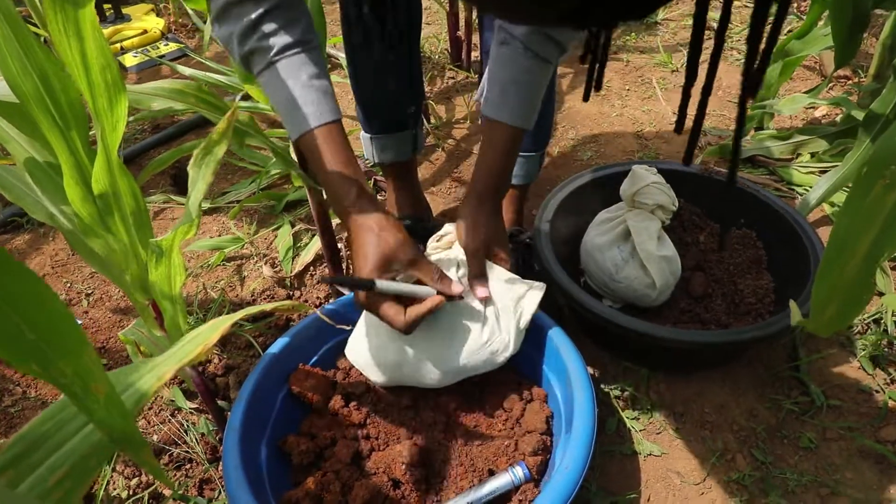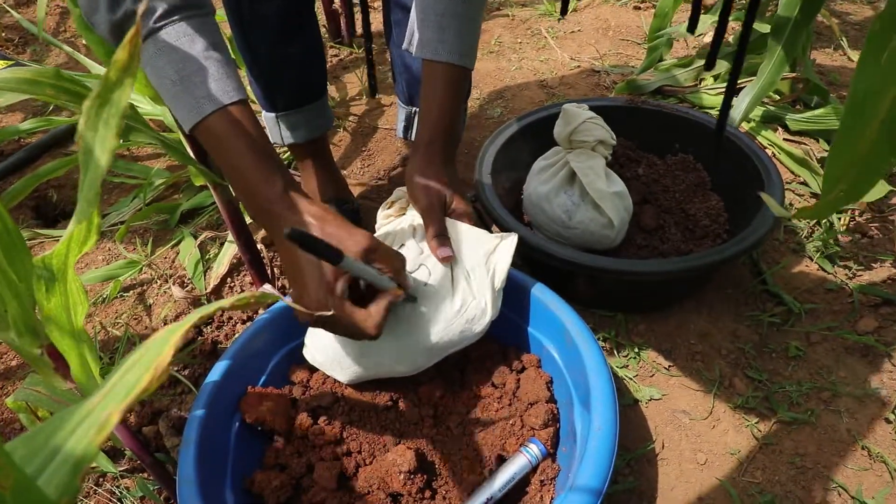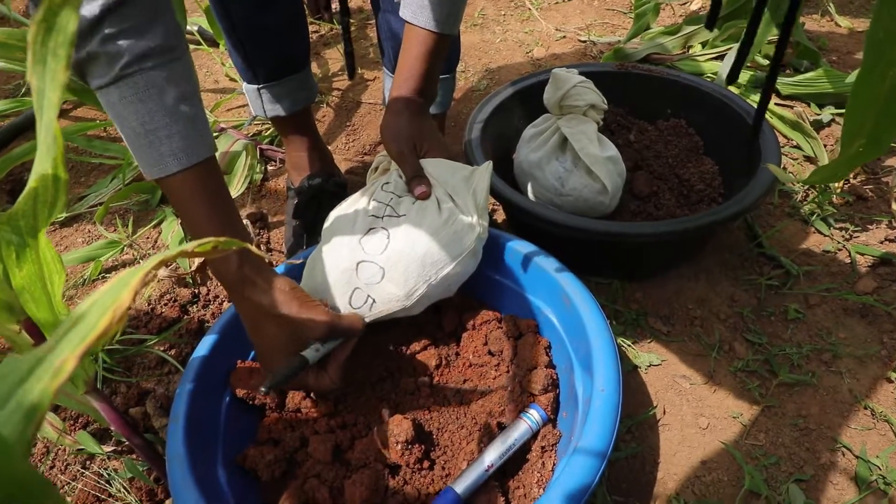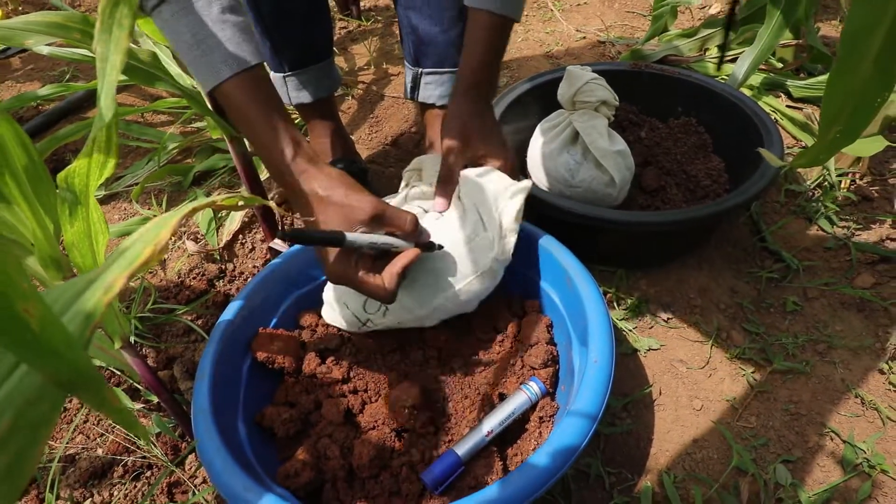Use the marker to mark the cloth bags appropriately with the soil sample ID you have been provided. Label the topsoil bags with a T and the subsoil bags with an S.